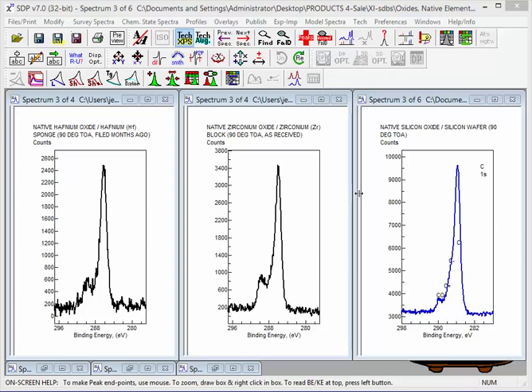This session is session number 11 about overlaying spectra. When we overlay spectra, we can often see subtle differences between materials that are very similar or have only slight differences in processes, different temperatures, different chemical treatments, different degrees of oxidation. So an overlay mode can be very valuable.